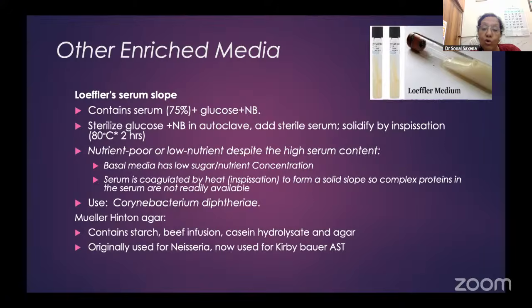Plus, it's got glucose in it. So the moment bacteria start growing, the glucose gets metabolized and you get acidity. And so it's hardly providing any nutrition. At the most, you can call it a solidified version of enrichment medium, but it's not a very good enriched media. Another enriched media is Muller-Hinton agar.